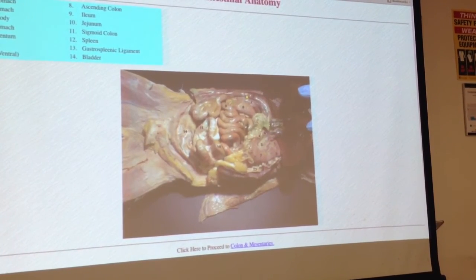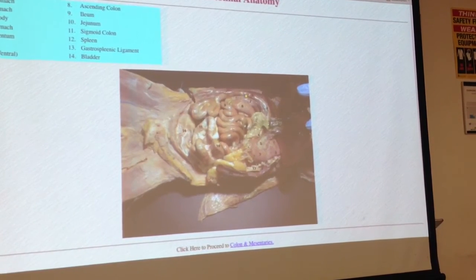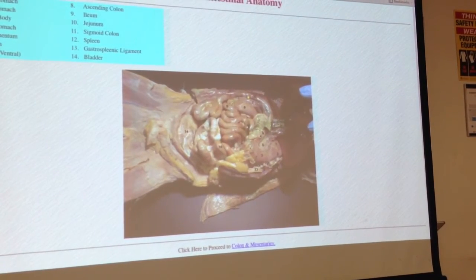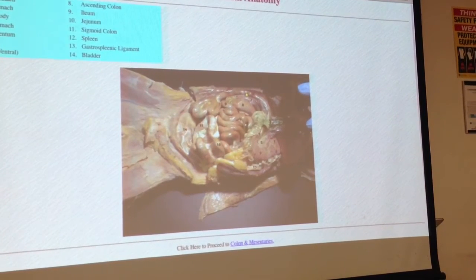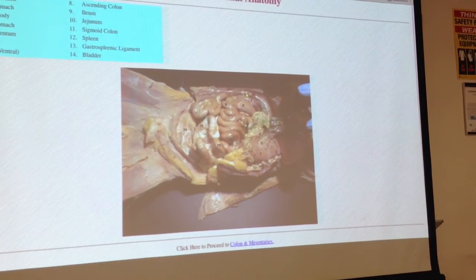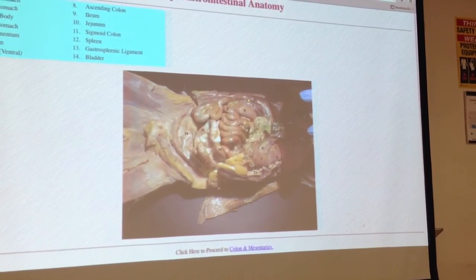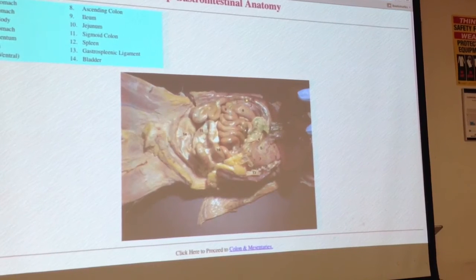This is going to be really helpful to do because if we're going to be showing you the different segments of the small intestine, just like I explained, we'd be showing it to you with the body models. We're going to be showing it to you connected to the stomach. So we'll pull it out like this. Usually it kind of just juts deep, so you may have to do a little bit of digging, but it's not that bad. So dig out the duodenum, and again, we'd show it to you as being connected to the stomach. I'd say about 4 inches out is about as far as we'd go if we're calling it the duodenum.